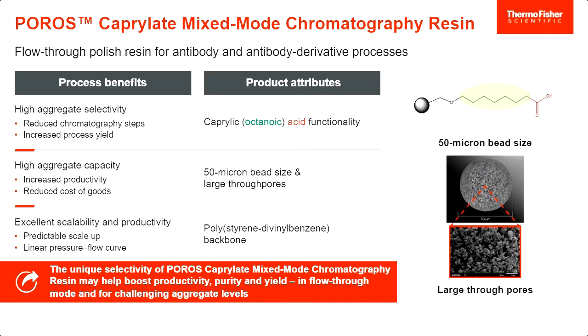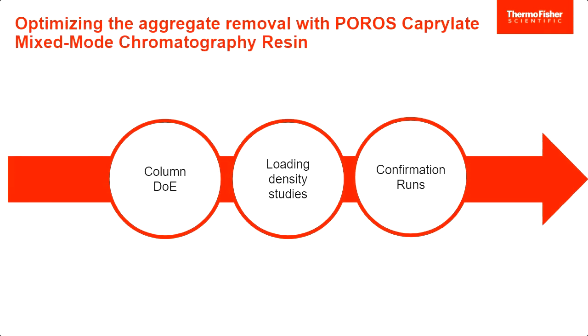Now, we performed a series of experiments to test the ability to remove aggregates and other impurities. So next, I'll review some data that we generated in our DOE and load density studies, as well as I'll also summarize some impurity data that were generated.